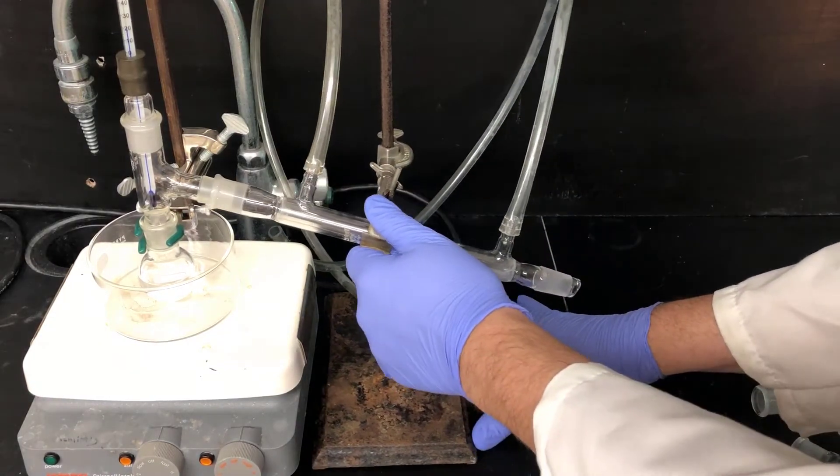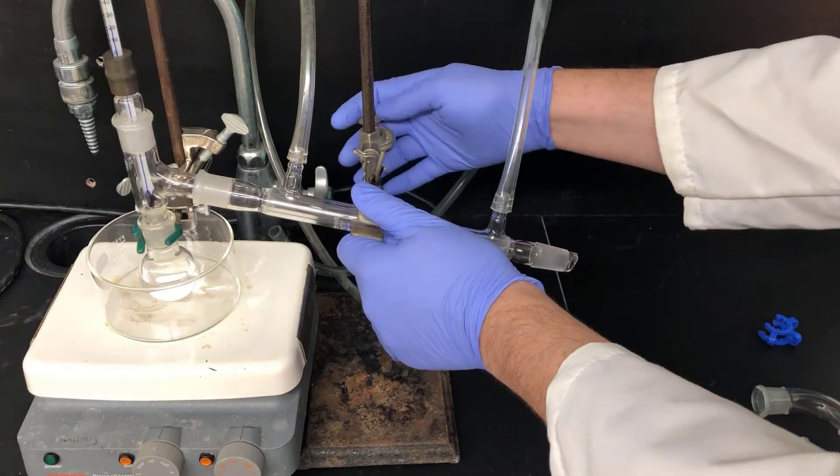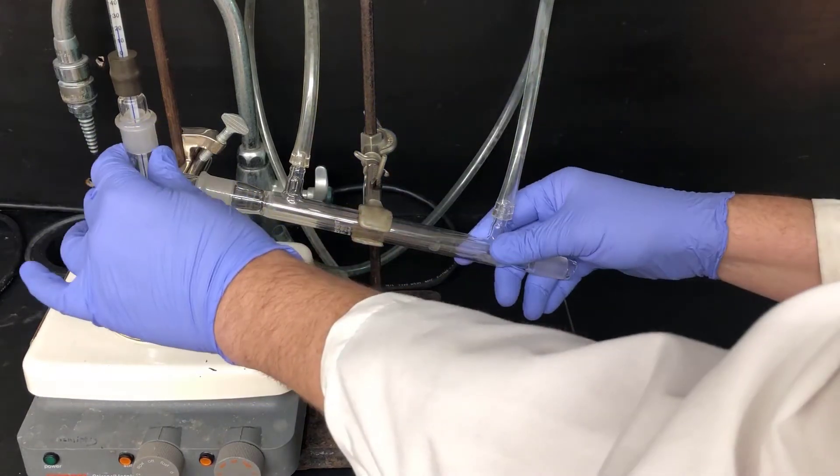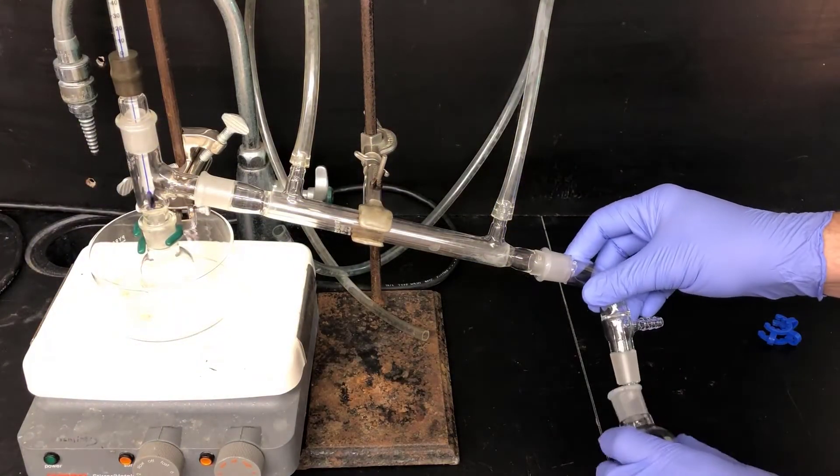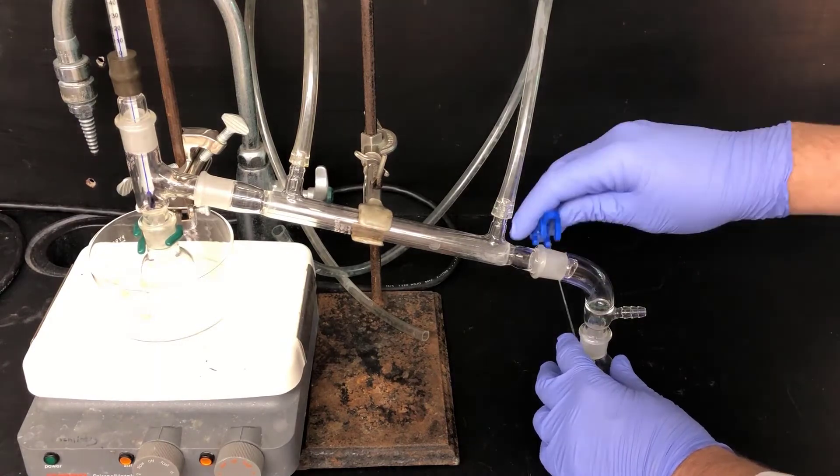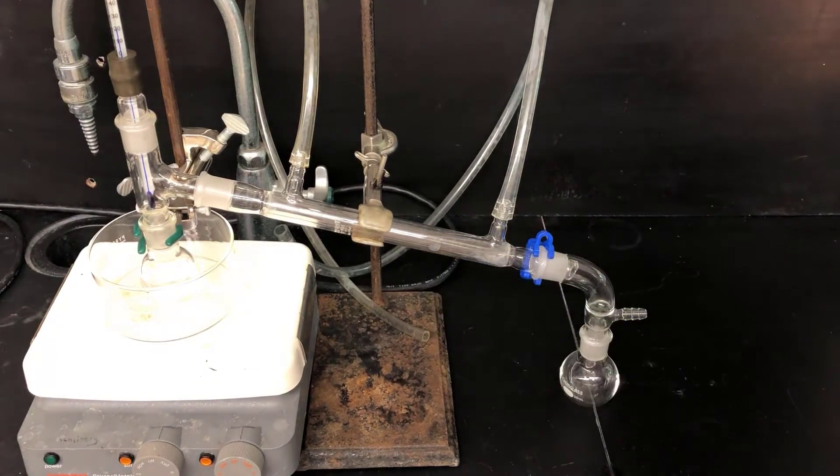Now I'll connect the condenser to the distillation head. I'll clamp it down and make sure all the joints are nice and tight. Then I'll add the vacuum adapter and the collection vessel, and secure these with two blue Keck clamps.